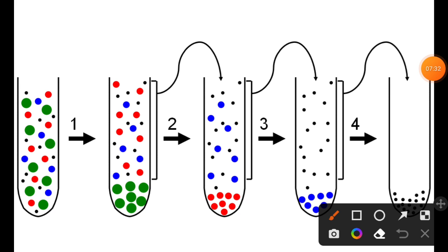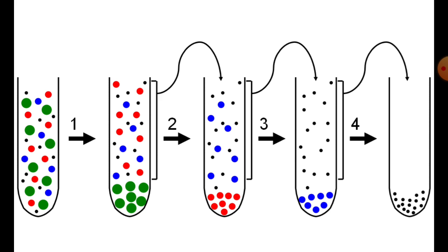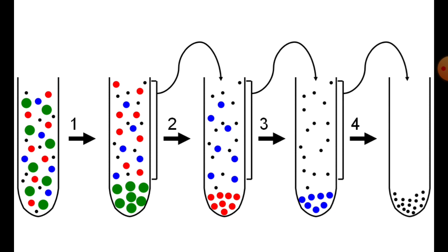And that's how, depending on the differences in sedimentation rate, differential centrifugation can separate particles. Okay, that term differential is used because here we are performing different centrifugation to separate each of the particles based on their differences in sedimentation rate. So that is the concept behind differential centrifugation. An example where we are using differential centrifugation is the subcellular component separation. That is the very important thing.